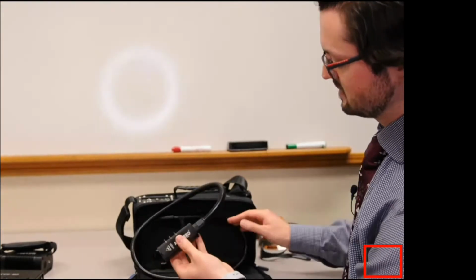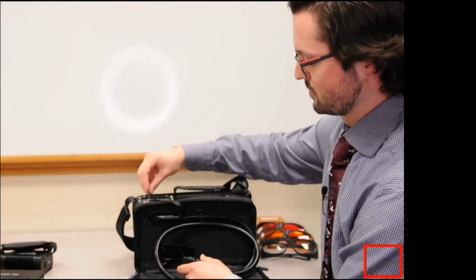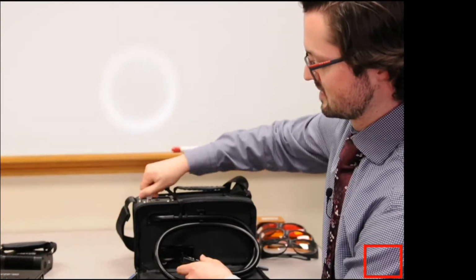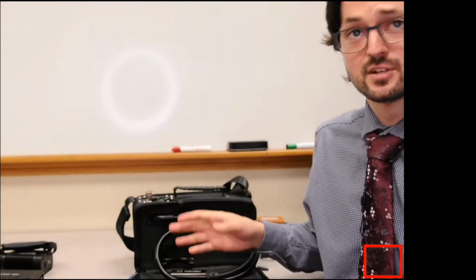There's a little safety key, because, you know, safety first. And then we just go ahead and plug it into the top of the box. So now the laser's active. It's not turned on yet. I still have to turn it on.